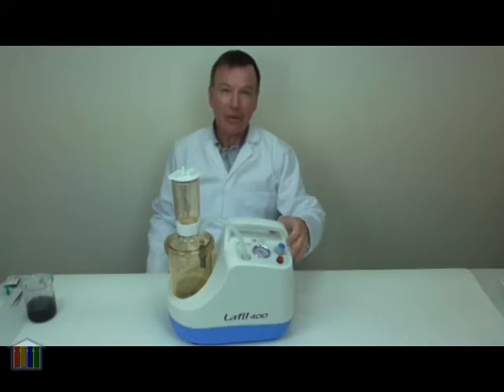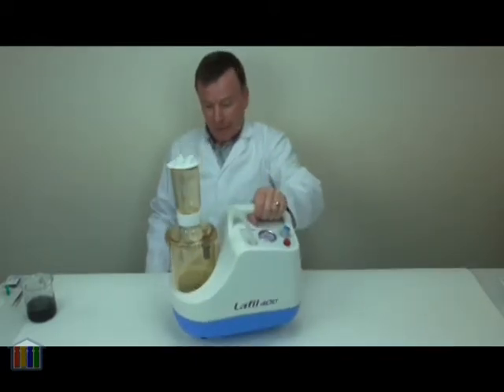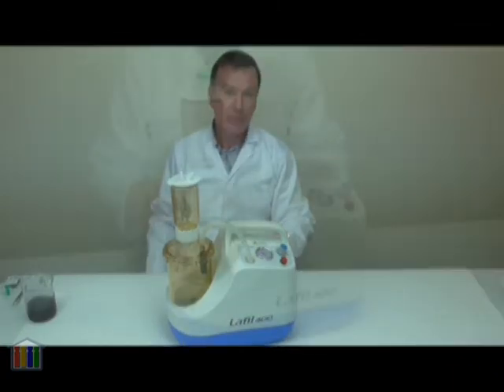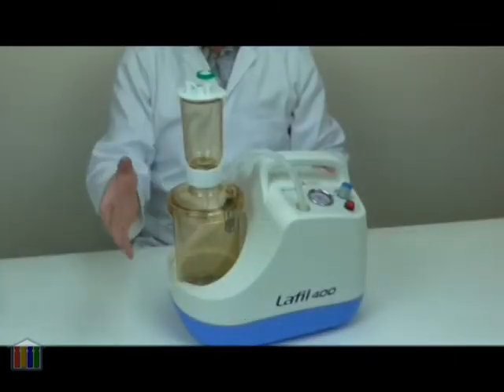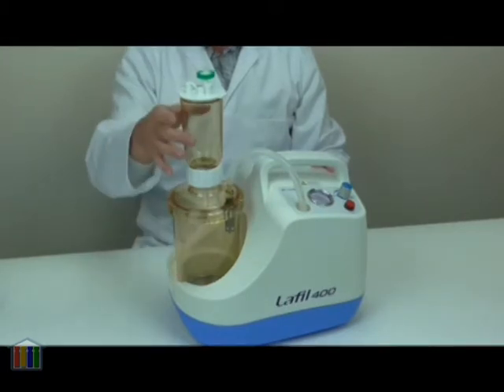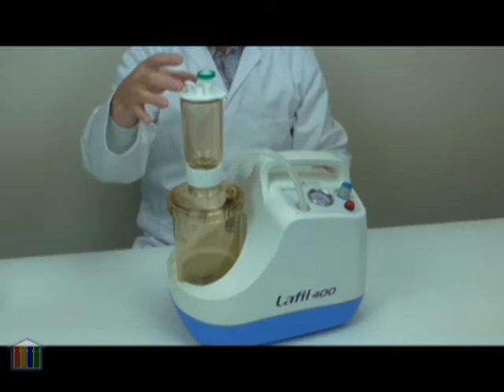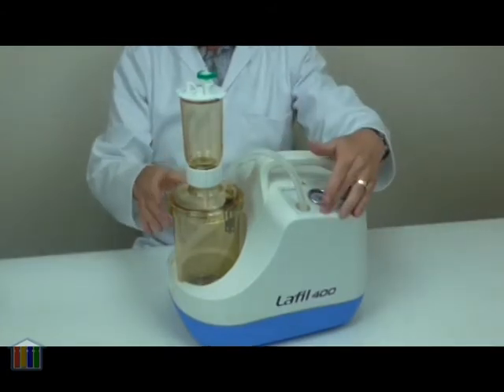This is an easy to use and portable laboratory filtration system for filtering samples and solvents without using any water pumps. The system consists of a vacuum chamber, a sample funnel, a lid with air filter and a connection to the integral vacuum pump.